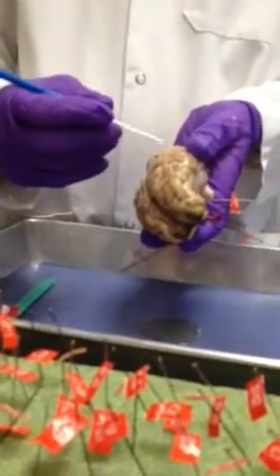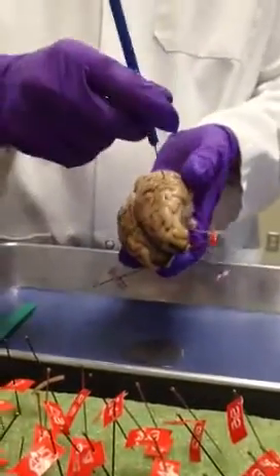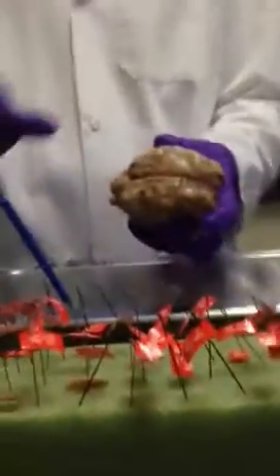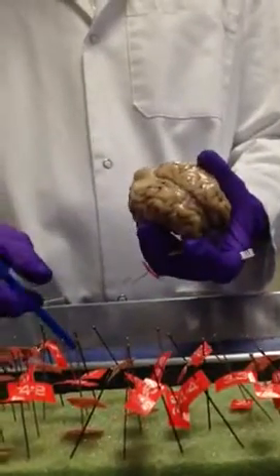Between adjacent gyri is a sulcus, kind of shallow. A fissure is a deep gap. There's a fissure there. It's a transversal.